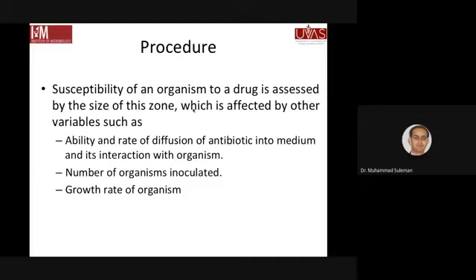So ये सारे फैक्टर्स जो इन्वॉल्व होते हैं, इनमें से कोई भी फैक्टर अगर गड़बड़ करेगा तो आपके जो रिजल्ट्स हैं आपकी टेक्निक के वो वैलिड नहीं रहेंगे. You will not be able to rely on those results.